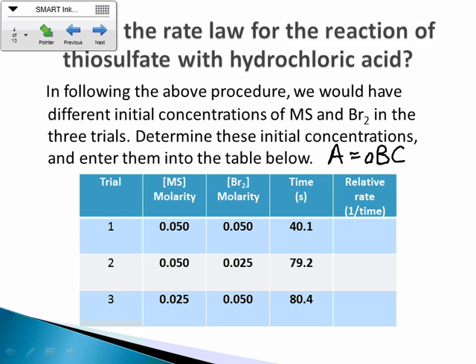But anyway, this is Beer's law, right? So if you know the absorbance, you can graph the absorbance over time, and you can figure out the concentration. Okay. So that's a good way to do it, which is why I want to show that to you on the second day that we do this lab. But for the first day, just do 1 over time, and that'll give you a relative rate, and you can work with that. Okay.